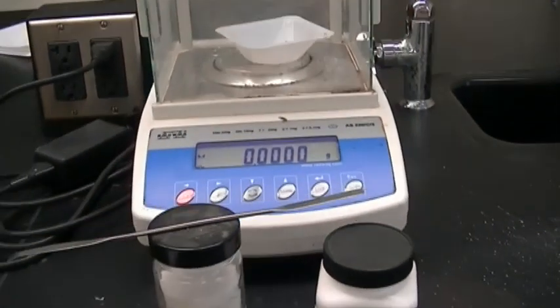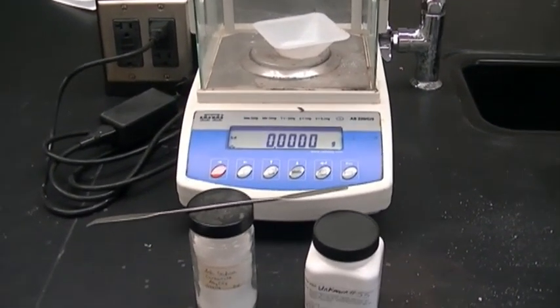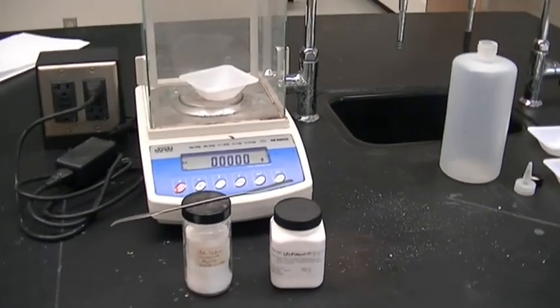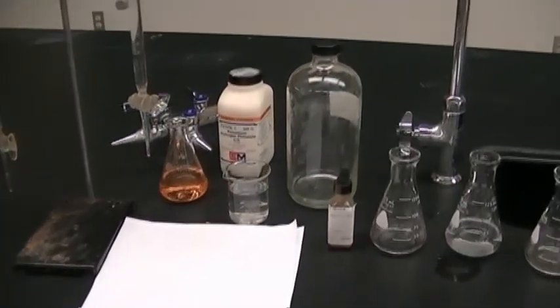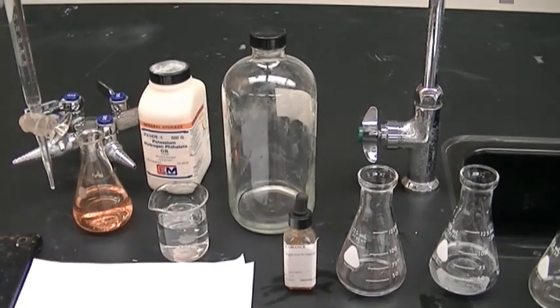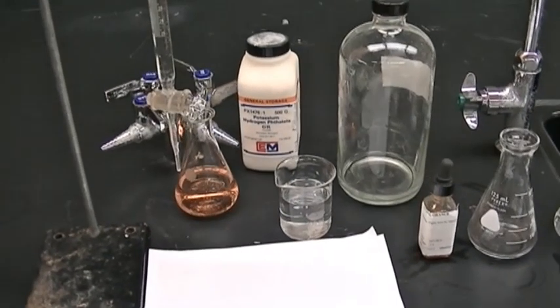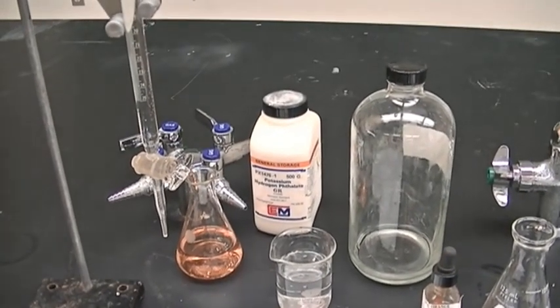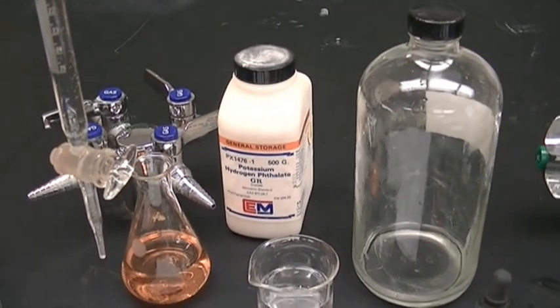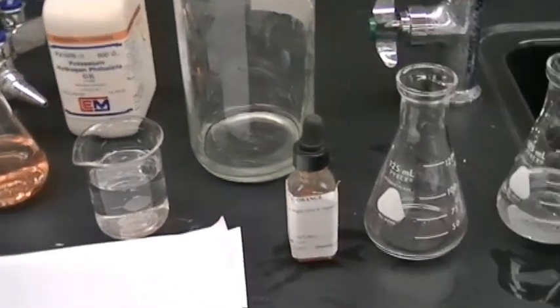All right, and so I am going to measure accurately on a 4 decimal place balance the proper amounts as listed on the procedure. And then we're going to do a titration. I already indicated that I took 4 mils of 6 molar HCl, and I added it to 200 mils of water. And I now have that in a small beaker here. Also in the procedure, it said to mix 0.5 grams of KHP, which is potassium hydrogen phthalate, in 50 mils of water, and add 4 drops of the methyl orange indicator.